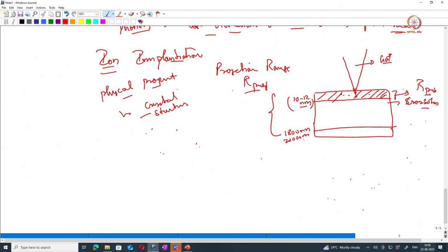If grain boundaries are present, then the grain boundary chemistry will change, and other characteristics of the specimen too. So local composition may change in the solid solution. We usually call this gallium damage, due to the gallium implantation into the sample surface.